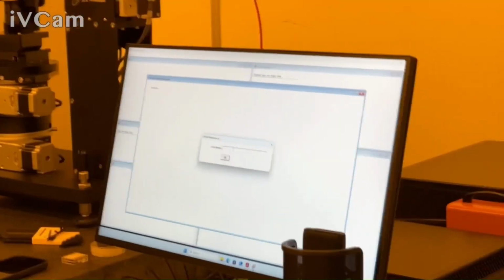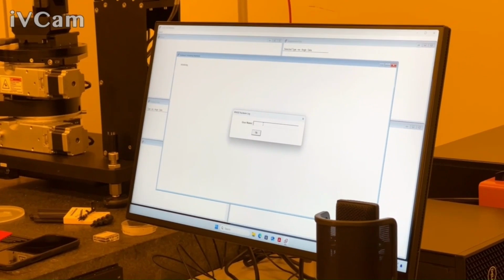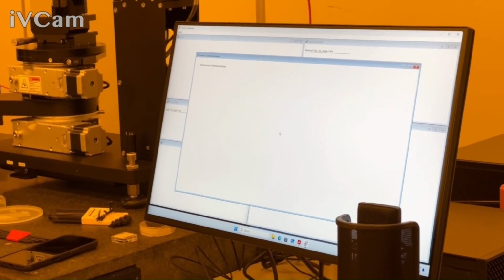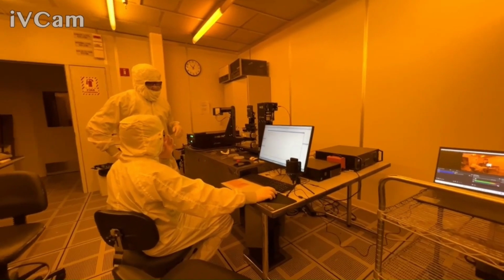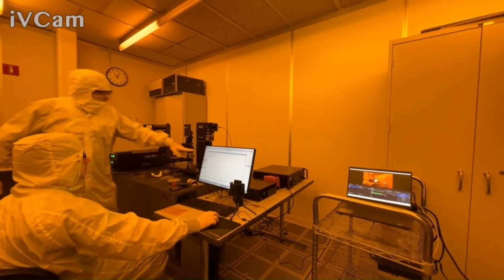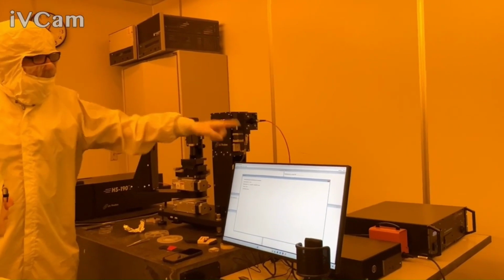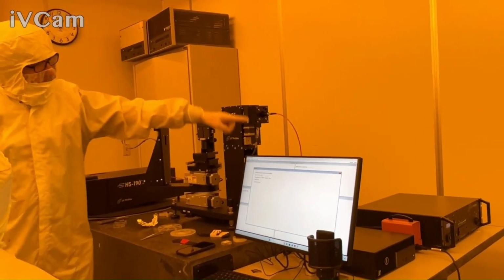Then I guess this is up to you guys. This will get stored in the log, so if you are having different people log in, it doesn't require a name. It's not like it's password protected or anything, but sometimes people want to know who screwed it up. Yeah, we have logs for these, so putting in our names is probably good. So it basically says initialize, but not calibrated. So it's talking to that box. Now, if that box had not been on, it wouldn't be able to initialize because there's an onboard computer in that control.